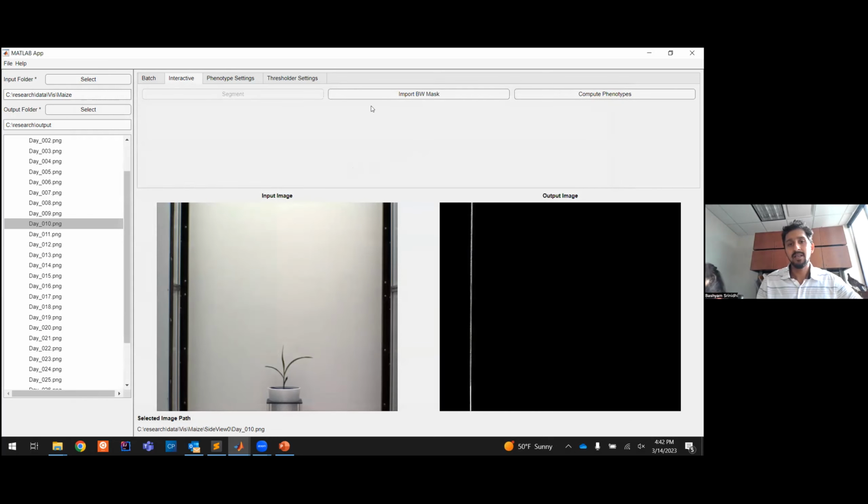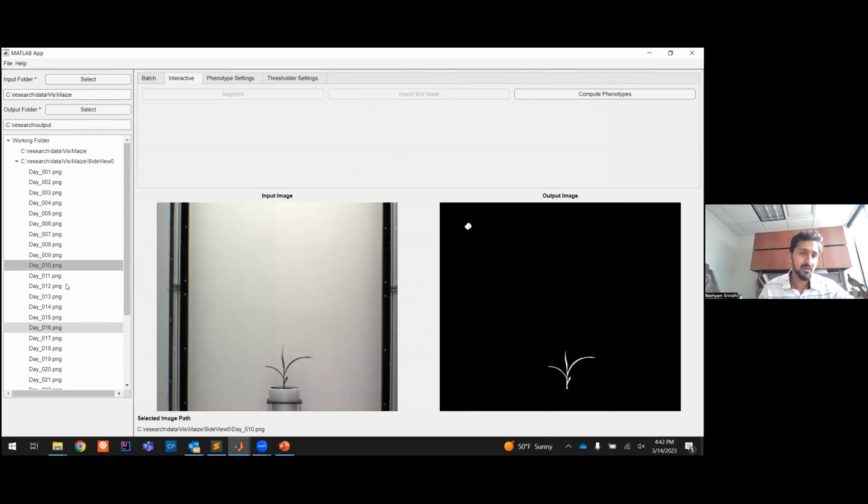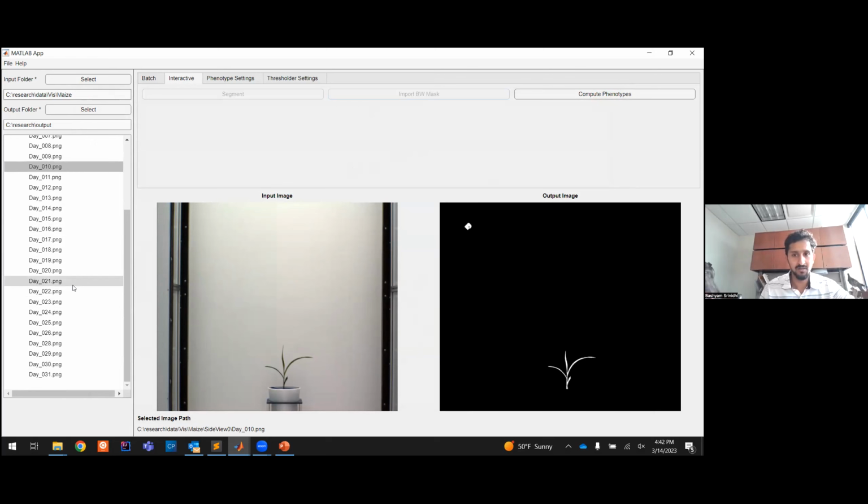And that should be directly available in the app, like that. So stuff like this can be done pretty easily. If there is one image that has gone wrong, we could quickly go and fix it and update the whole workspace, or the data can be updated automatically behind. So that's one advantage of this, where everything is in just one place, and we can change one thing, we can come back and change it the next day, and it will all be changed in the same place. So that's one advantage.